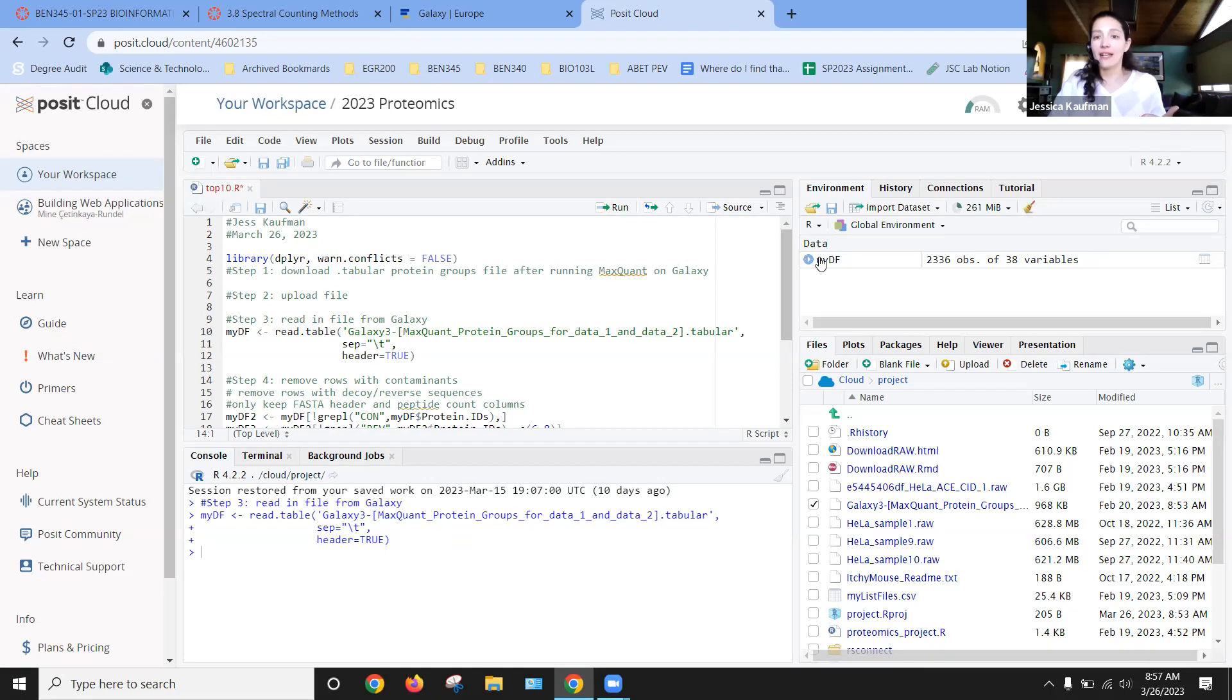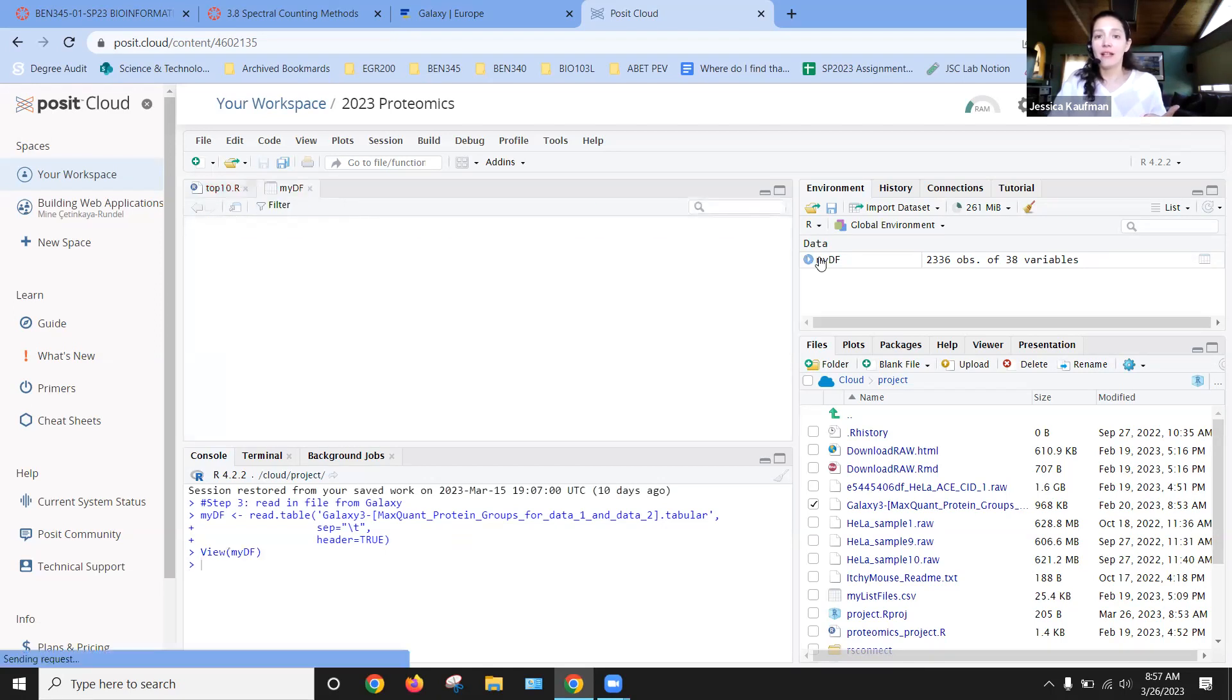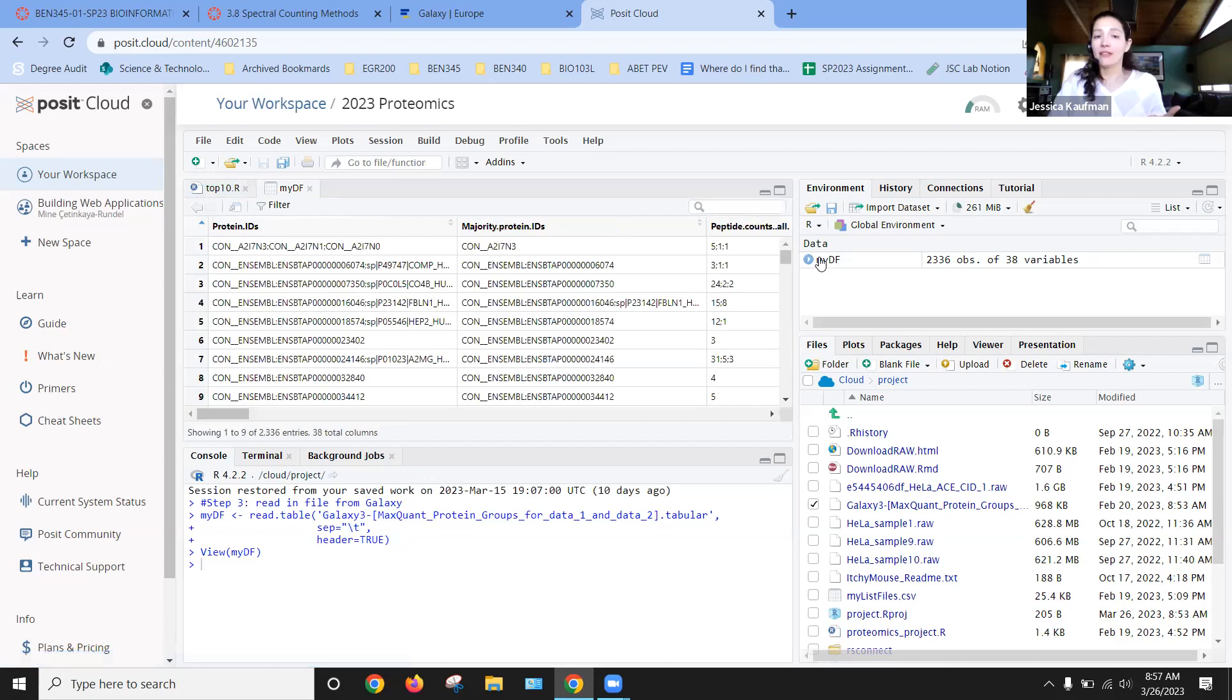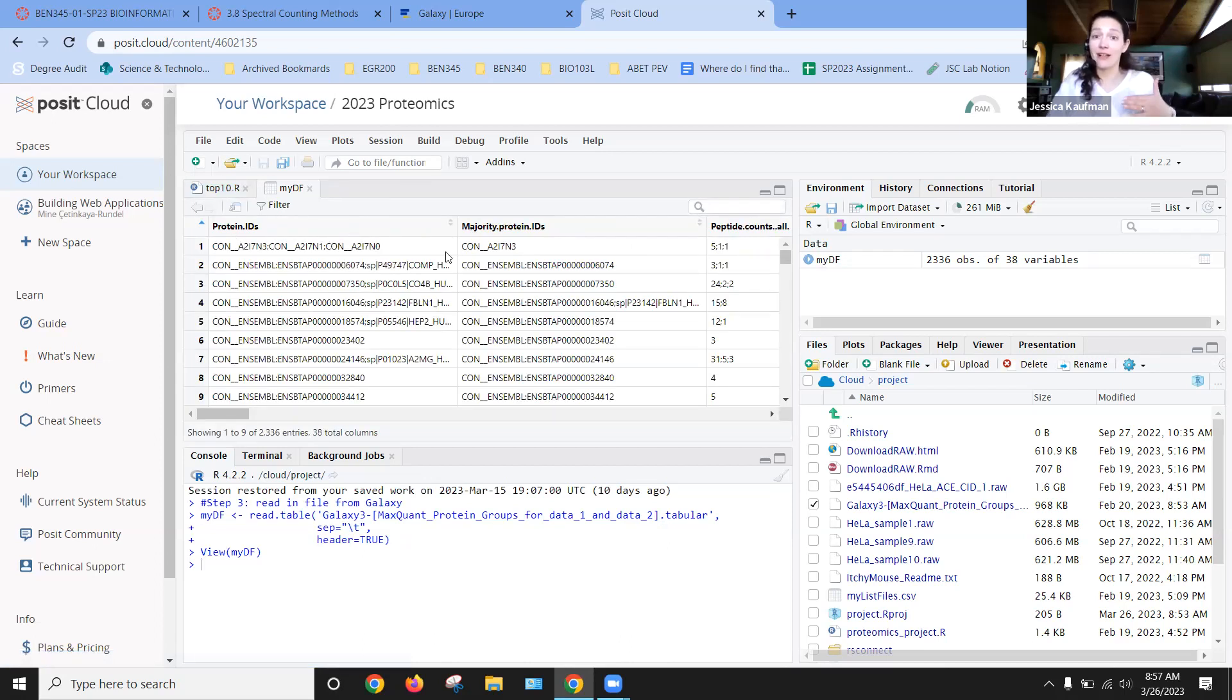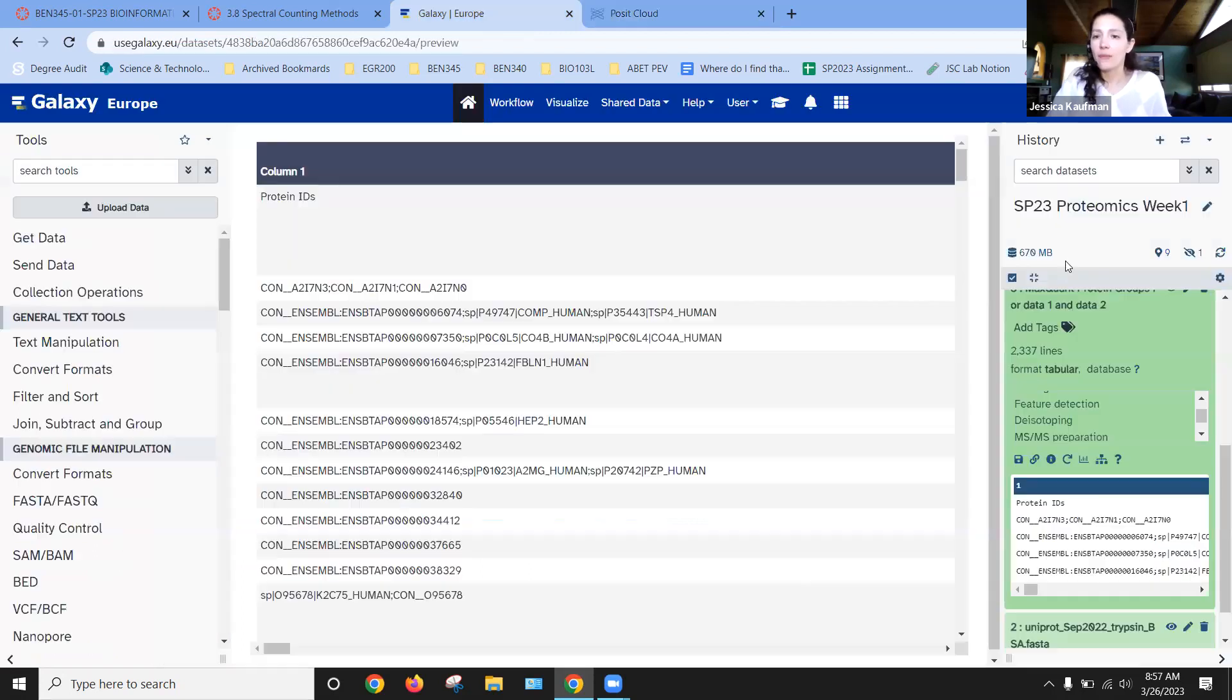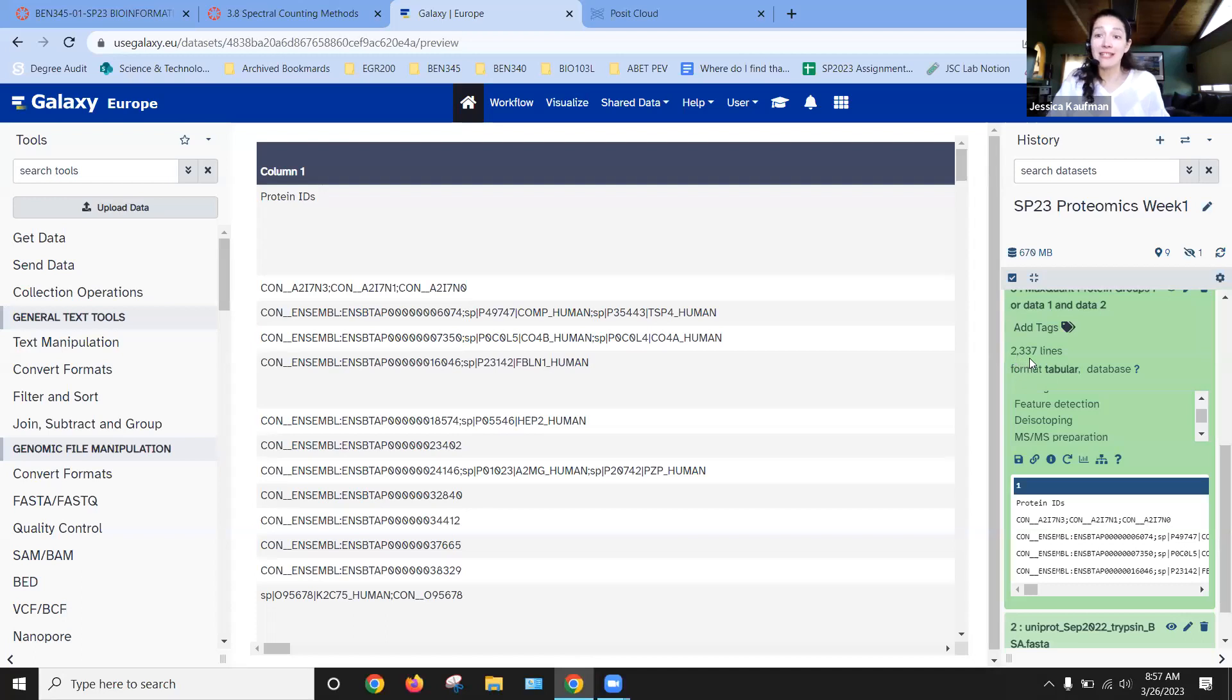So I can look at this. It looks like it read in okay, right? The headers are headers. They're not data. And it says 2336. So I go back to Galaxy and look, it's 2,337 lines. With a header, that's exactly what I got on Posit Cloud.